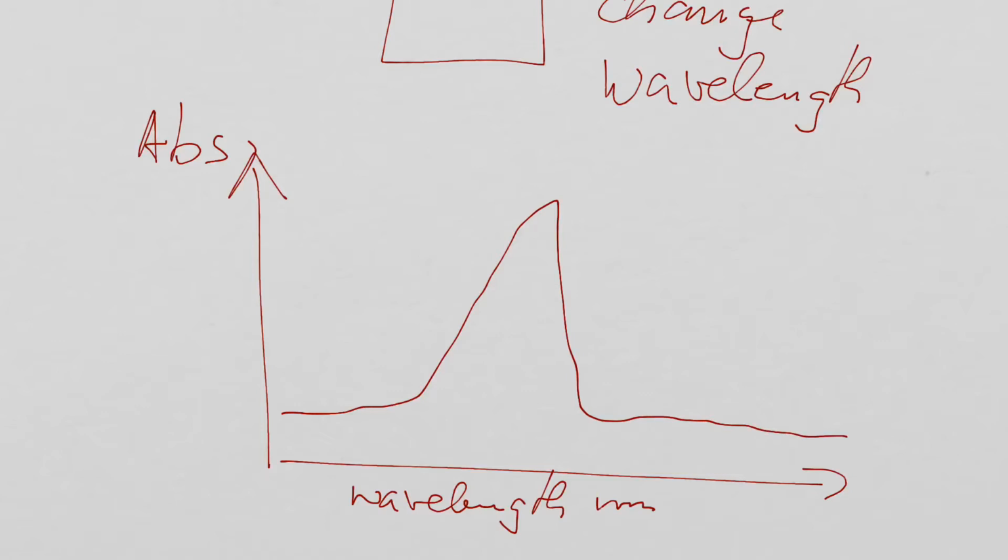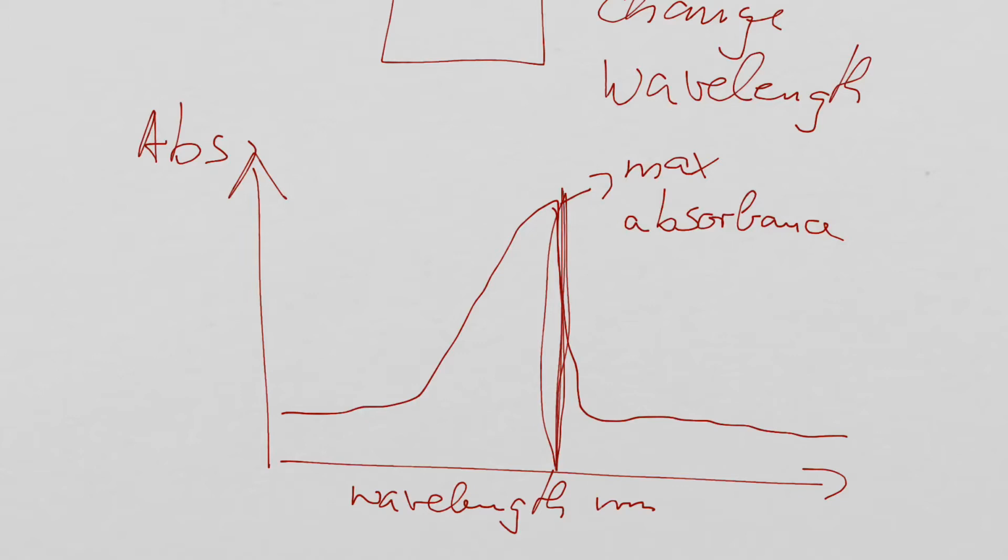This here would be maximum absorbance, at this particular wavelength here. So I found the optimum wavelength under which I have to do my experiments.